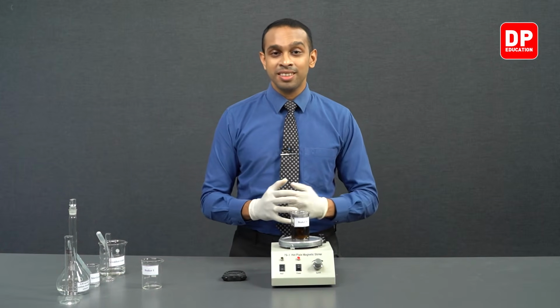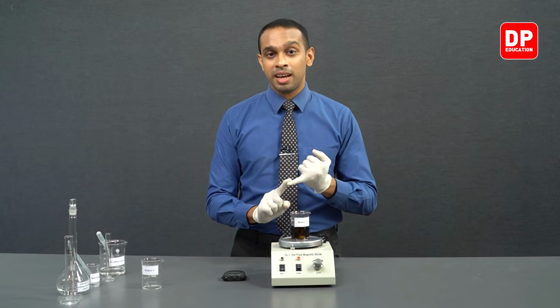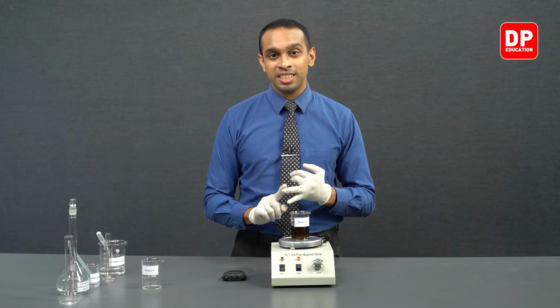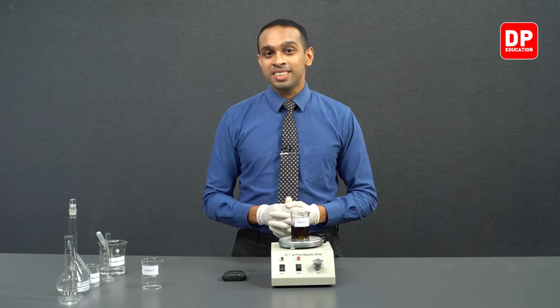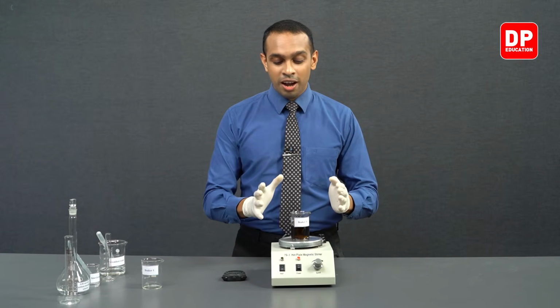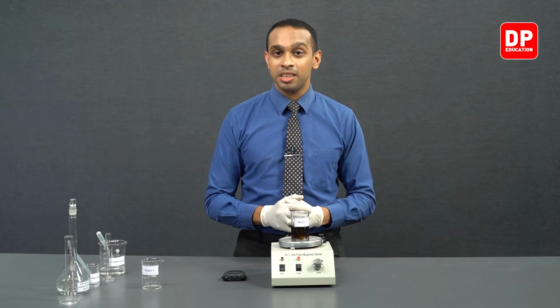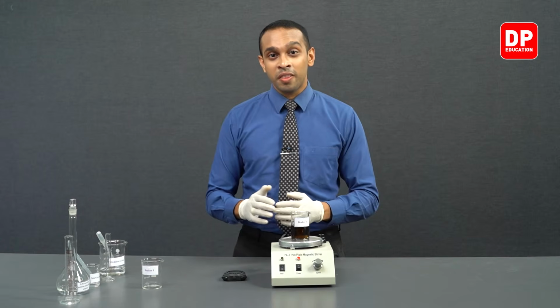So we can calculate the actual order of the reaction with respect to Fe3+ ions as well as with respect to I- ion concentrations when we move on to the next part of our experiment. After making sure you take down all of the readings we have obtained in this experiment, it is time for us to move on to the next part.